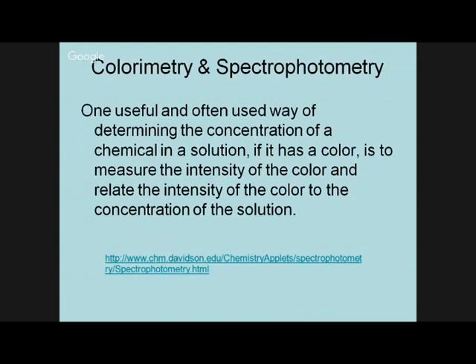So you collect the sample and you acidify that sample, because all the heavy metals are digested in the acid. After acidification and digestion, these samples are put for analysis for the heavy metals by the AAS, the atomic absorption spectrophotometer. The basic concept is spectroscopy. By the use of spectroscopy, you can identify these ions, cations, as well as heavy metals. And organic compounds, mostly pesticides and hydrocarbons, are analyzed by the use of the GC, that is the gas chromatograph.